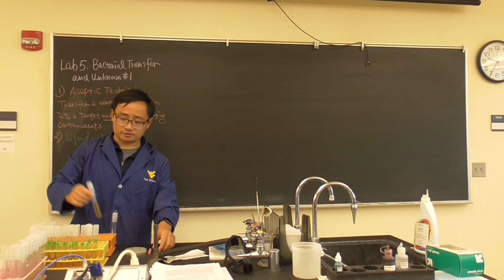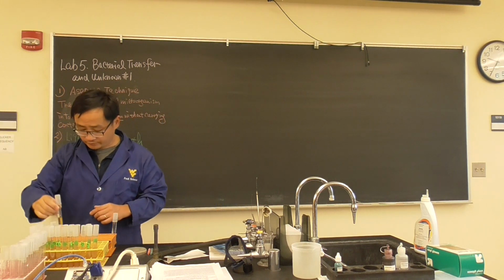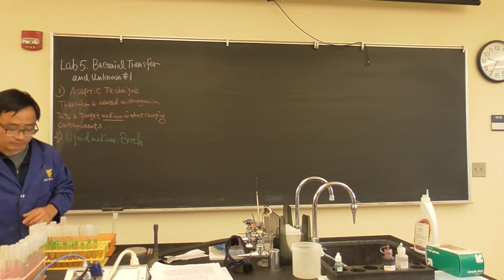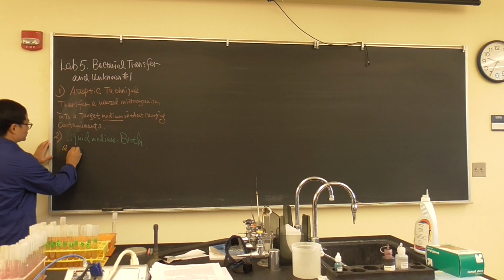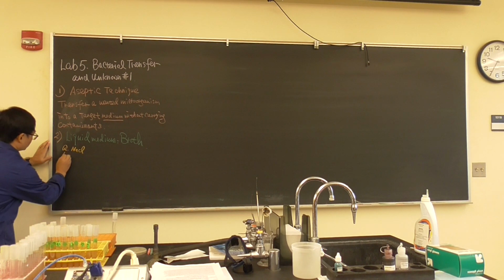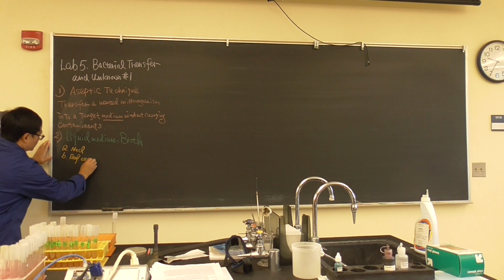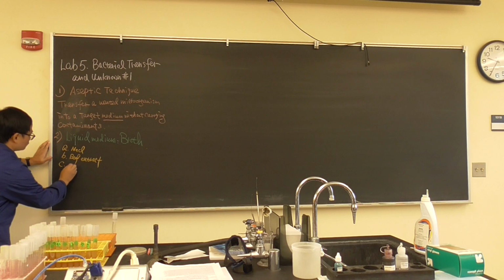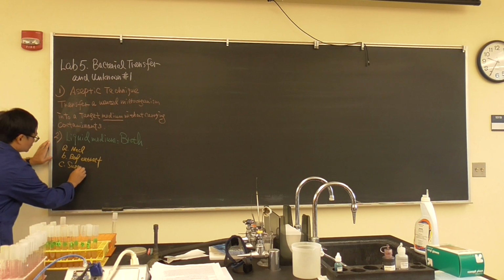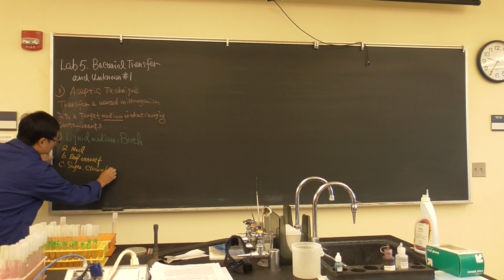It looks like this, a little bit of light yellow color, like tea. The ingredients obviously include salt, sodium chloride, and beef extract, because they give very high nutrition. They definitely have sugar, usually either glucose or dextrose.